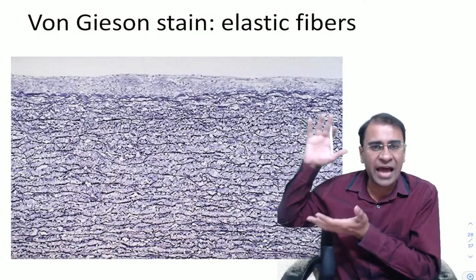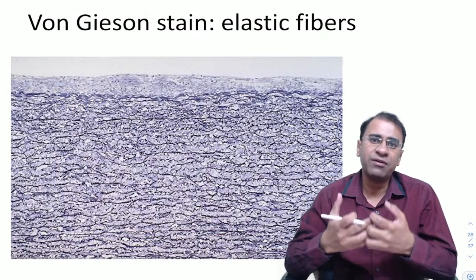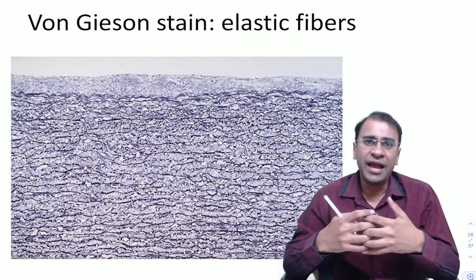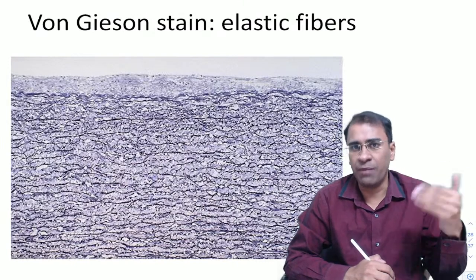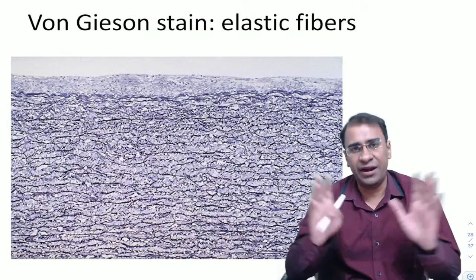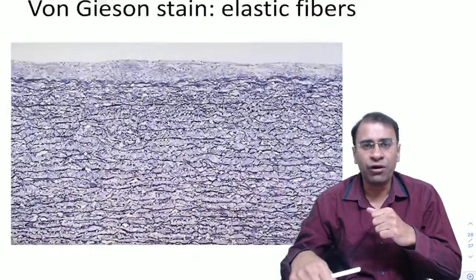Now this is actually an aorta. How can a history be given? A history can be given with, suppose, Marfan syndrome. So a patient has a degeneration of elastic tissues. It can be because of the mutation of TGF-beta, which is often seen in Marfans. In that case, all this elastin will be degraded. This is von Giesen for elastin fibers.